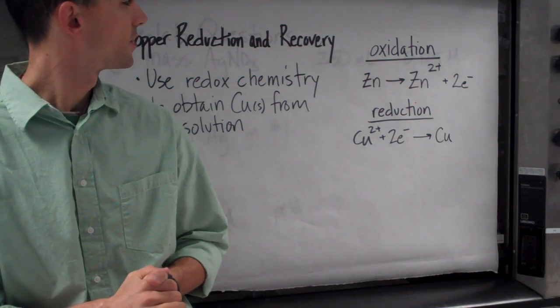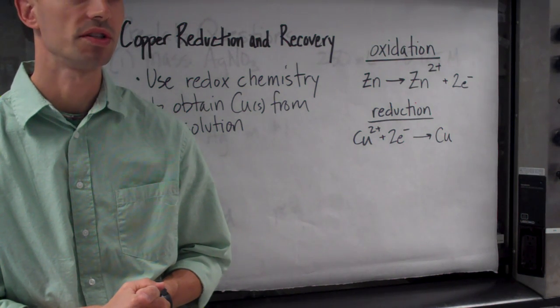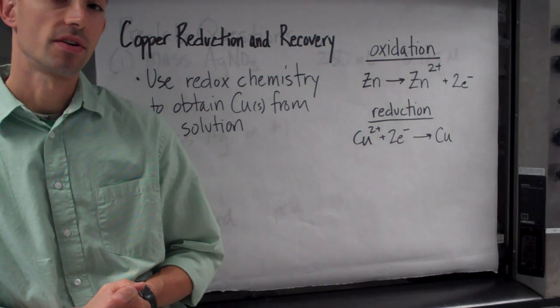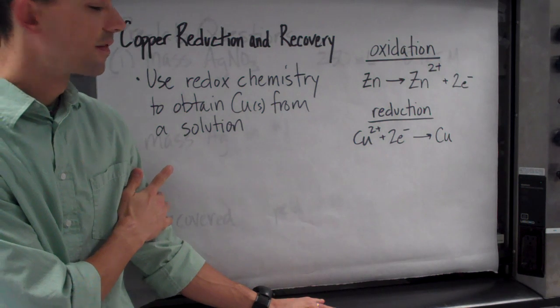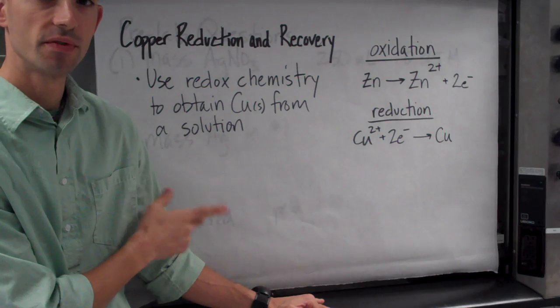This pre-lab video is for the copper reduction and recovery experiment, part of the General Chemistry 1 sequence here at York College of Pennsylvania. Today we're going to be considering how we're going to obtain a sample of copper from solution using redox chemistry, or oxidation reduction.